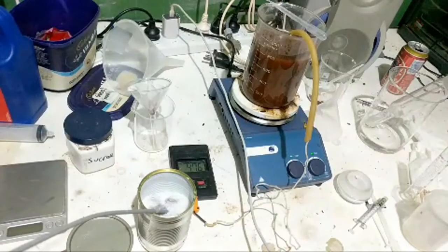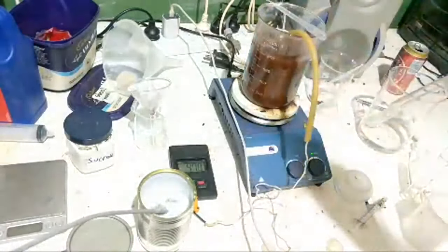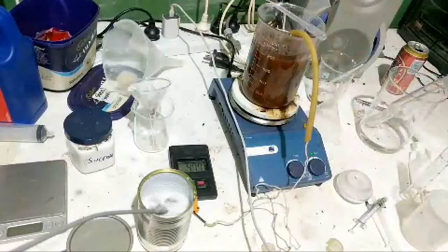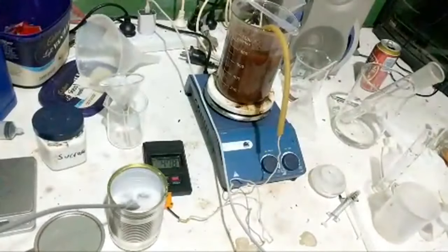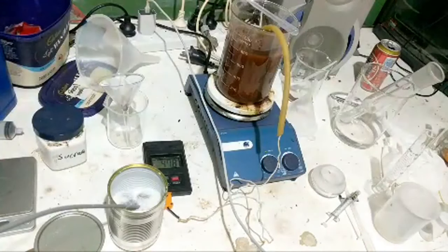Just to keep the sugar up. Sugar to keep the temperature up. Yes. So, we'll give this a shot. It doesn't light. Well, then we've just cocked up. Well, if it doesn't light, it's not too bad. But if it doesn't really work, then we've kind of ruined two preps for the day.